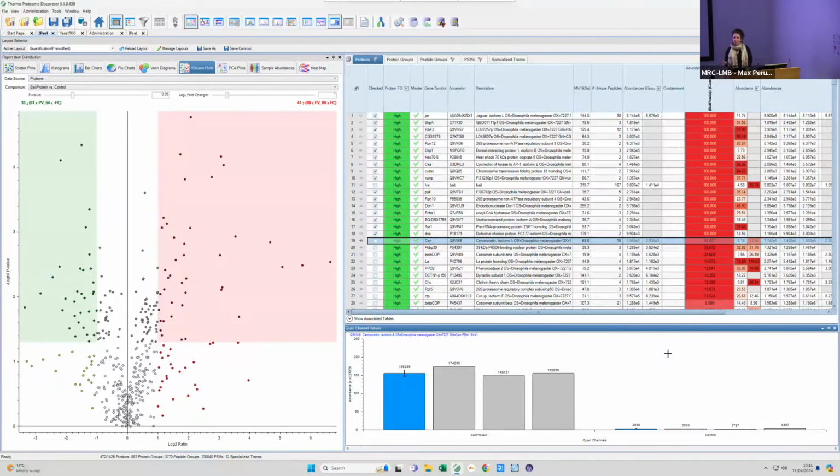Don't assume that only the ones that are not present are specific. It might not be the case. Any other questions? So it's basically another way of, in those situations that you ask, where you just have n equals 1, we can still do a mimic statistical analysis. It won't be perfect at all because usually we want n equals 3, but we can try and do some analysis for you if you only have n equals 1. Right.